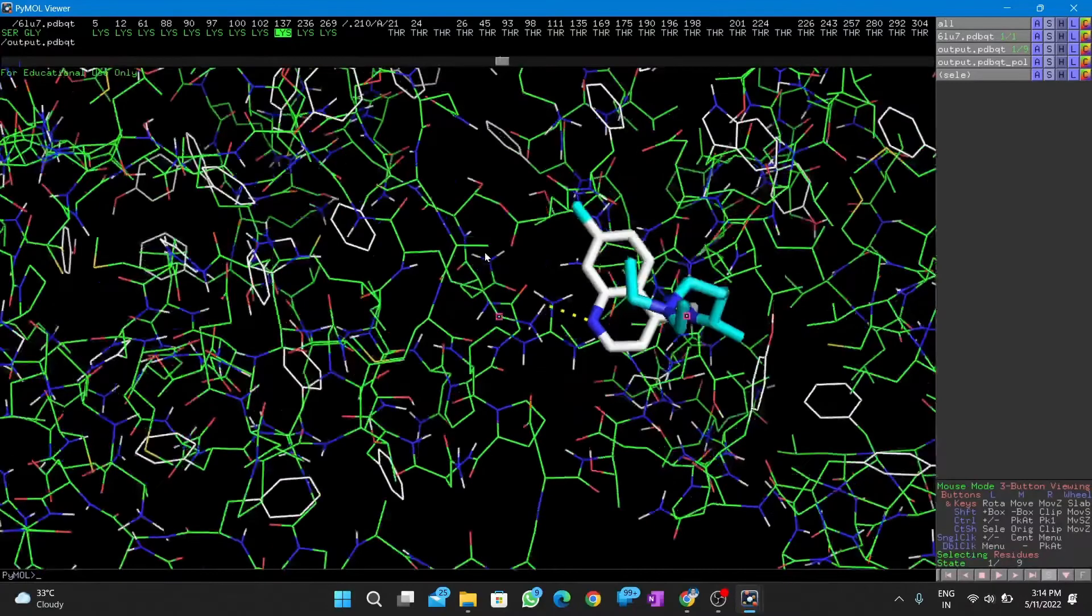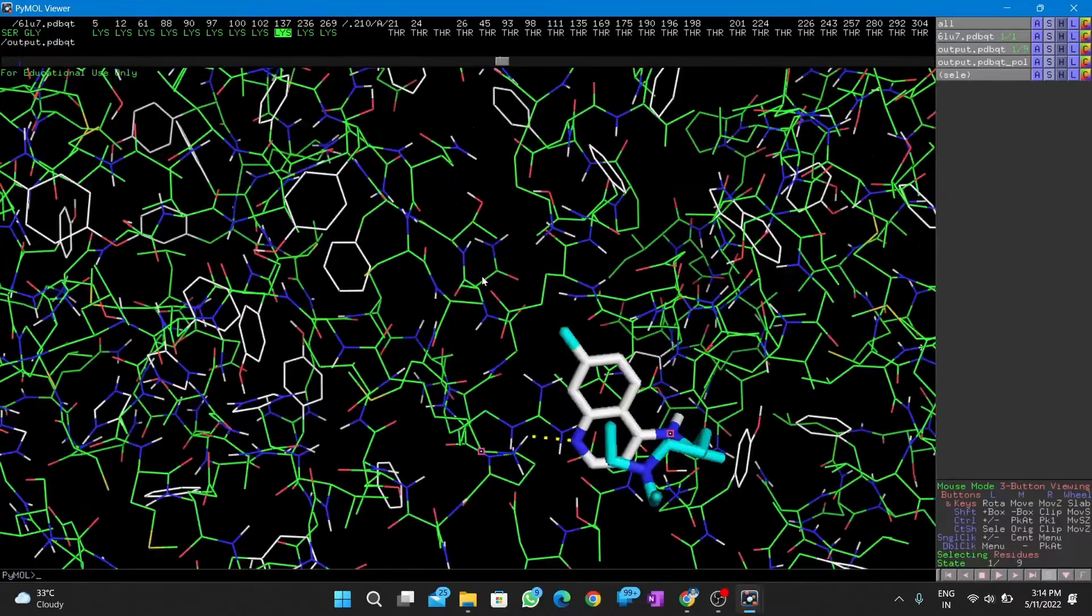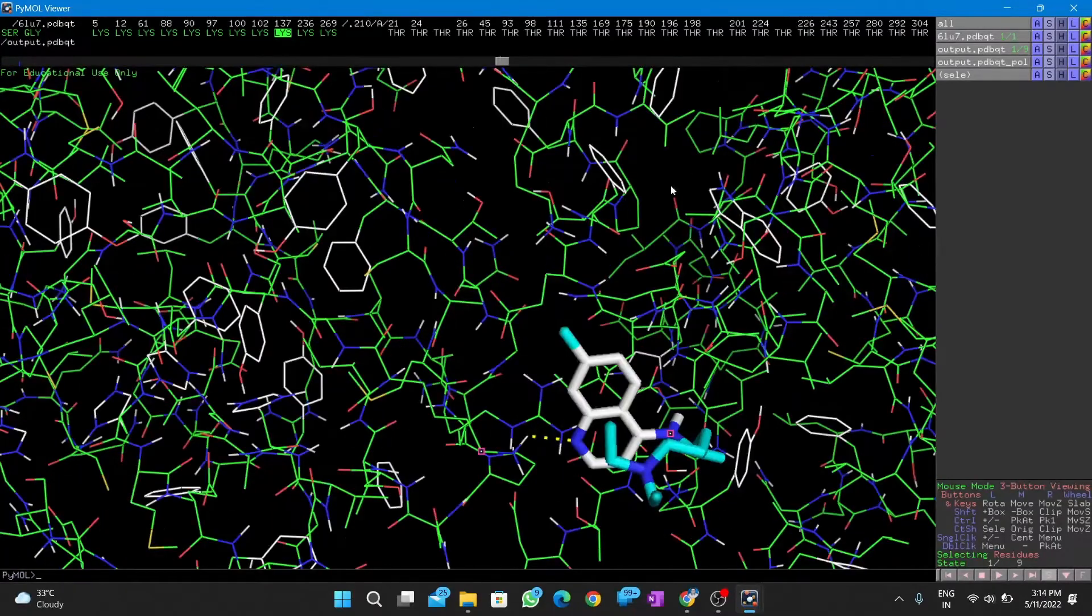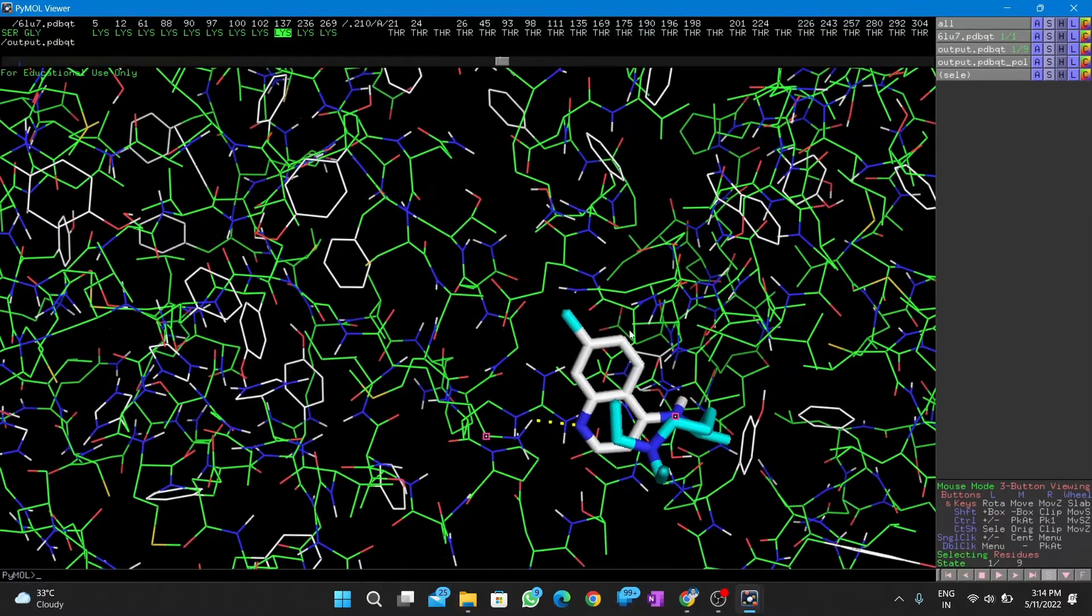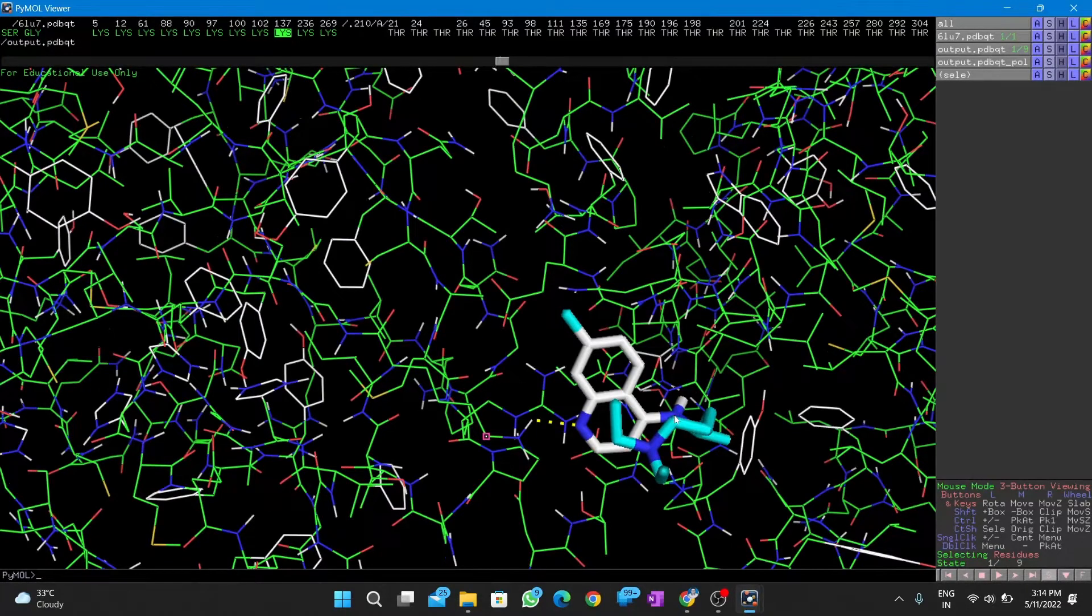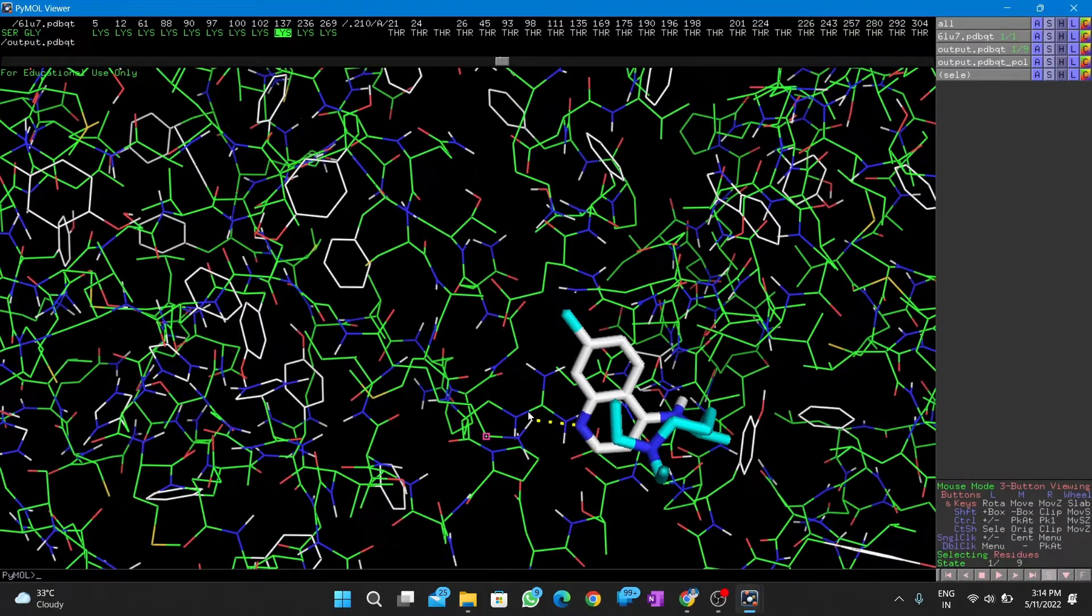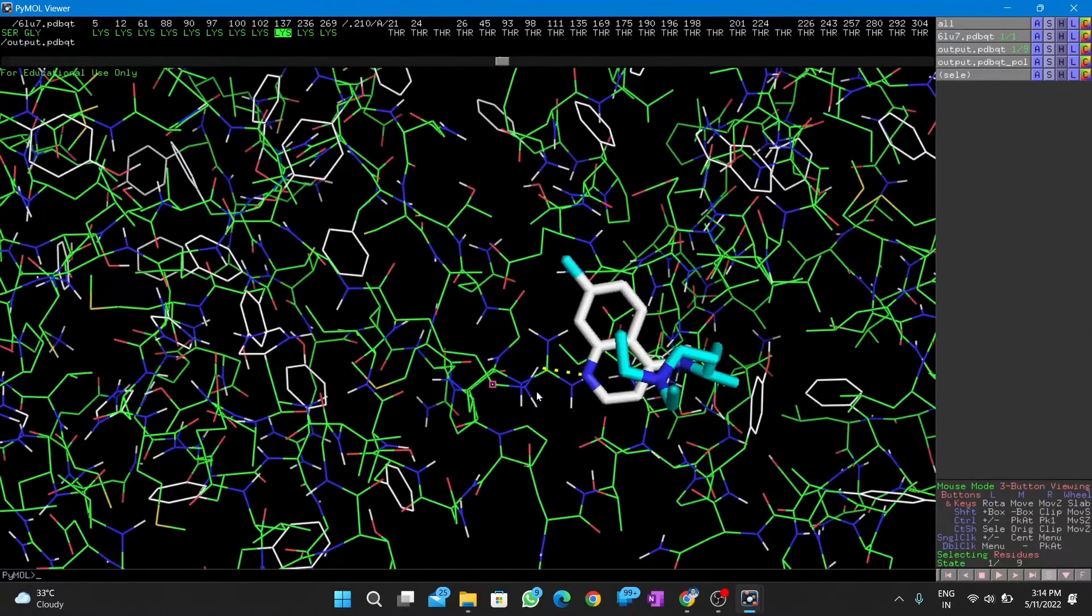Next, we select the entire lysine at 137. Do it very carefully.